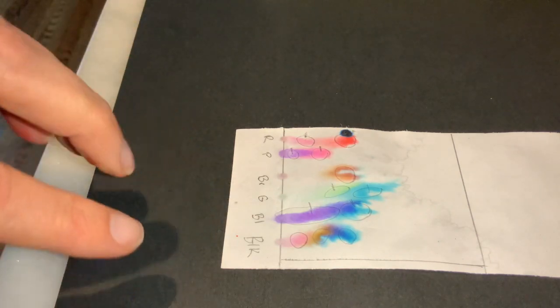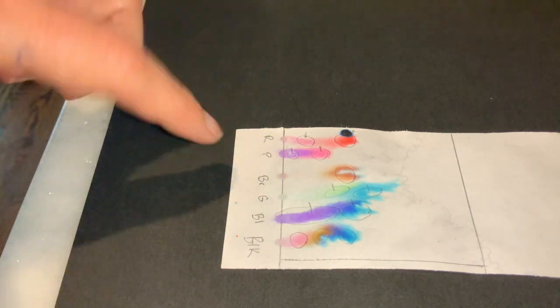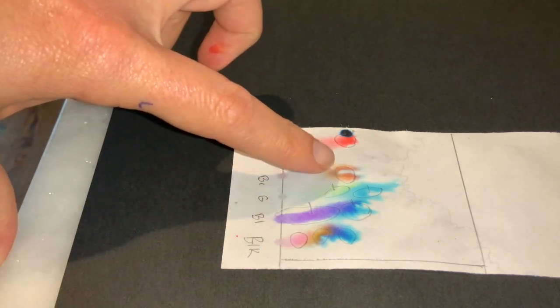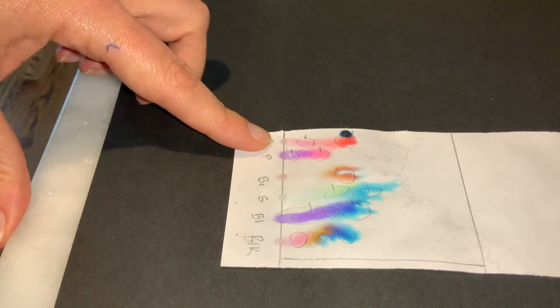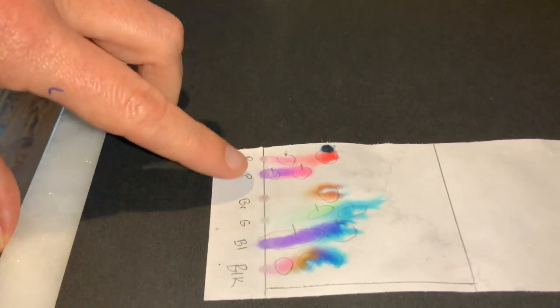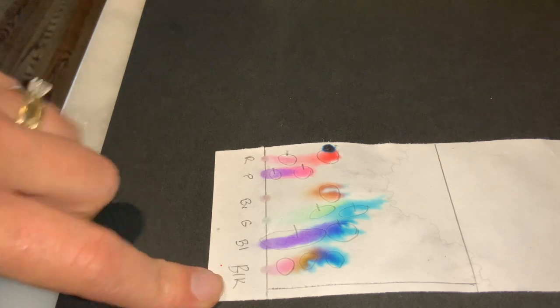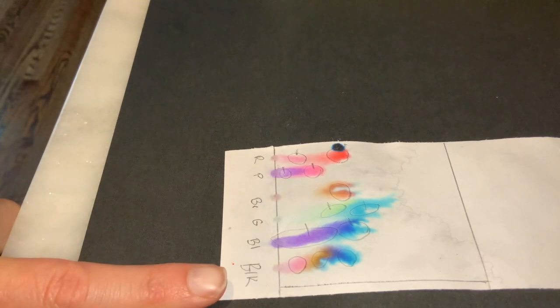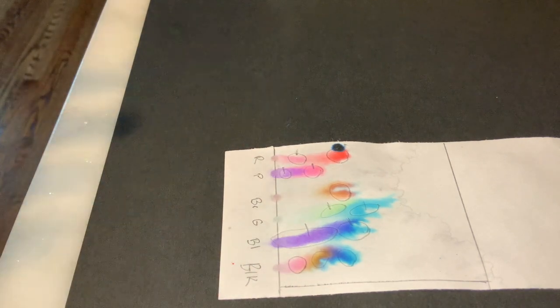And so for each ink color, you're going to have, except for the brown that only had one color in it. So red, you're going to have two different RF calculations. Purple, two different. And get to that black, you're going to have three different ones. And so you'll record all of this in your data tables.